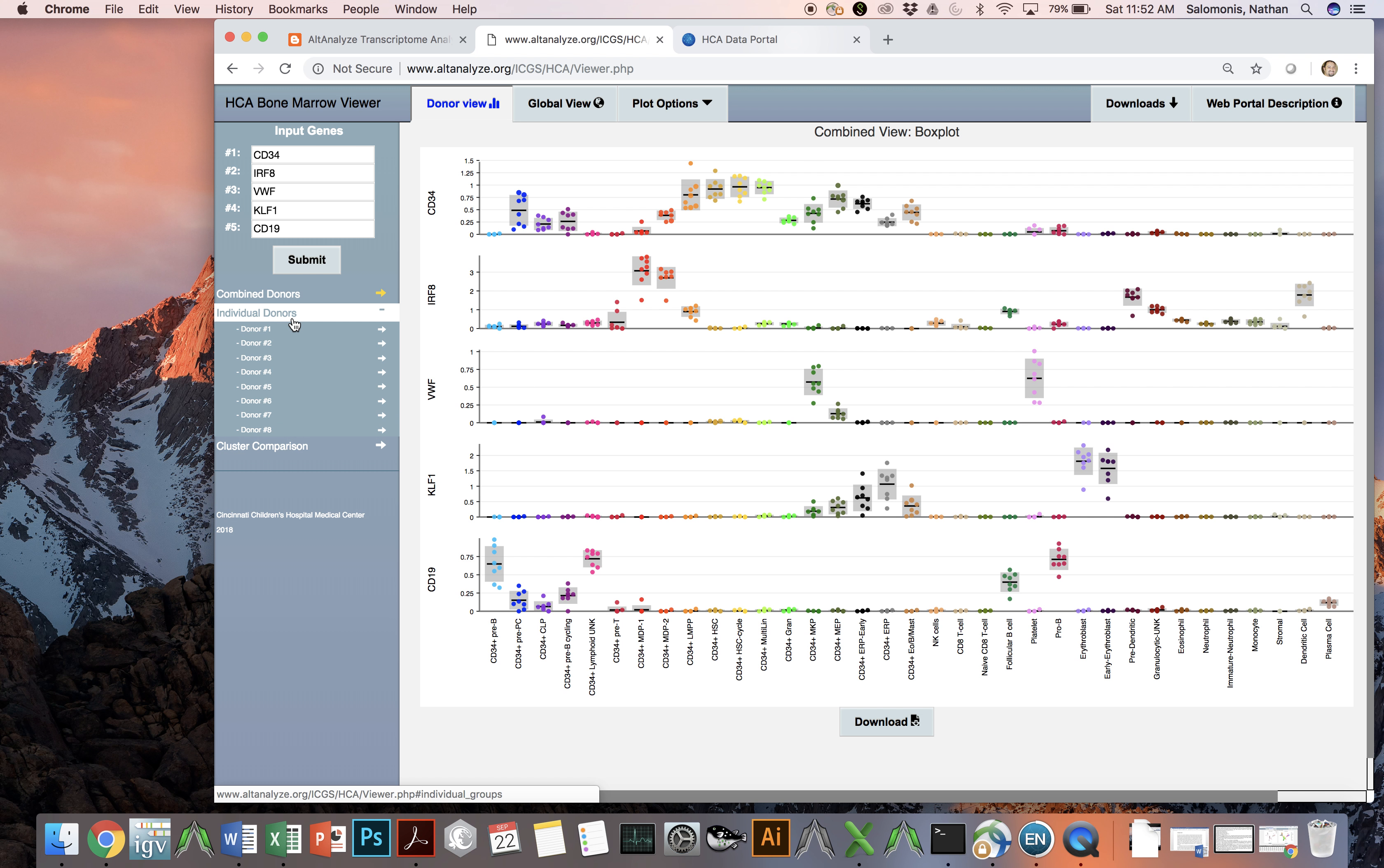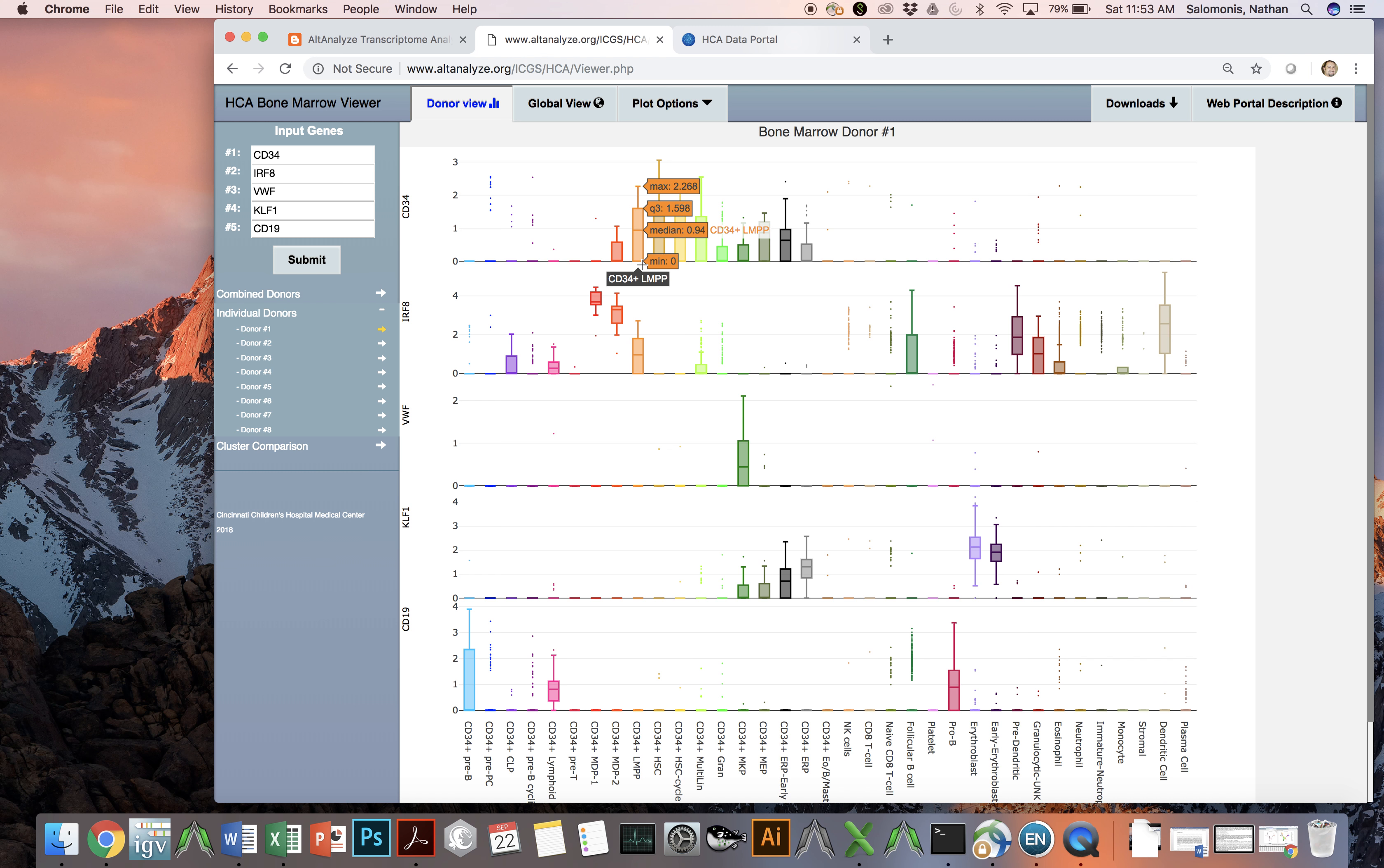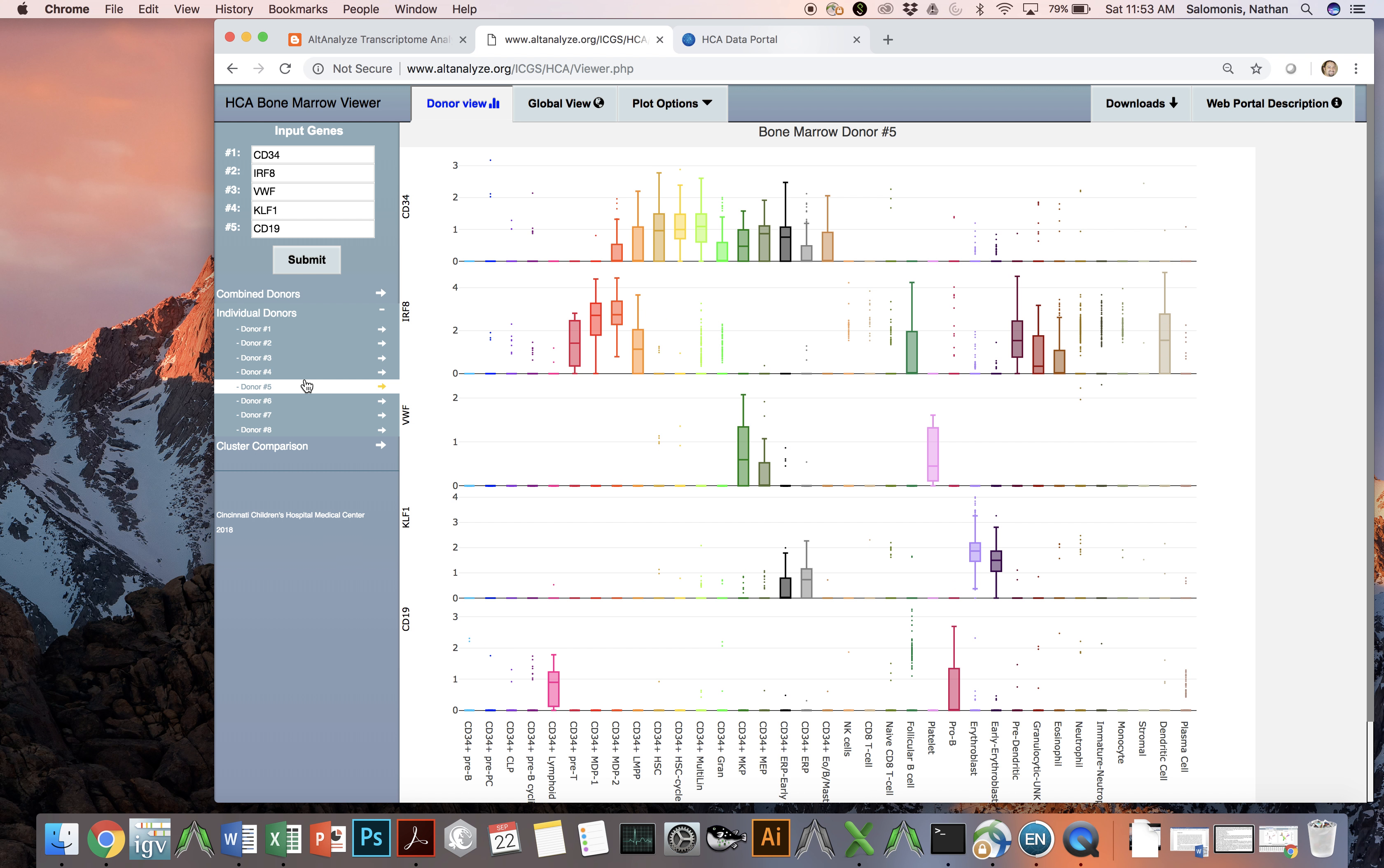You can also select individual donors, and if you do this, you'll see at first a bar chart view, which shows the distribution of expression of a particular gene across all cells within that population. And you can do this, of course, for different donors.